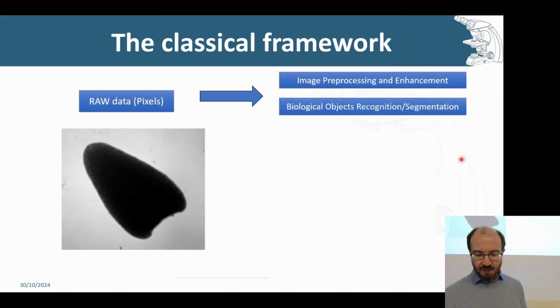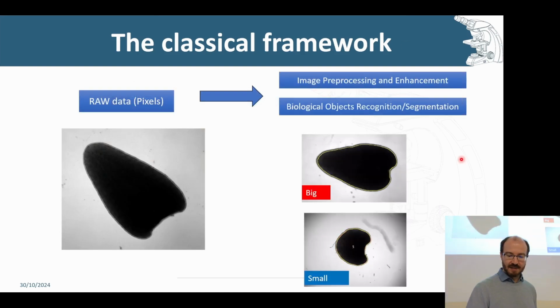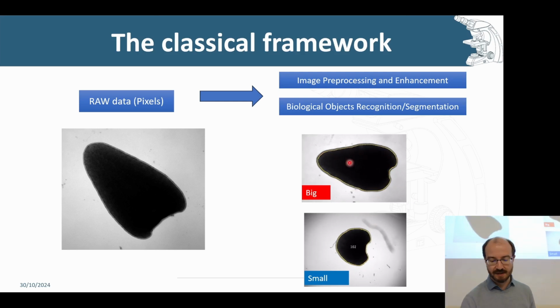Because all of those reasons or questions will ultimately feed into how I'm going to do the analysis. Okay, so now we've got the raw pixels, then we need to start with some image processing. So we have our population of things that we want to analyze, and then we maybe identified 2 separate, I don't know, parts of this worm that we want to analyze.